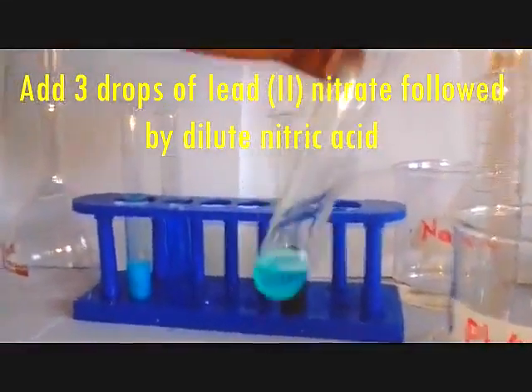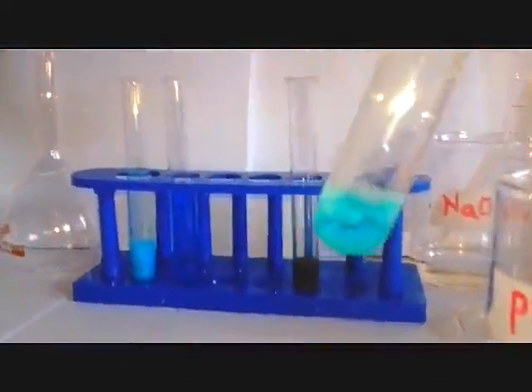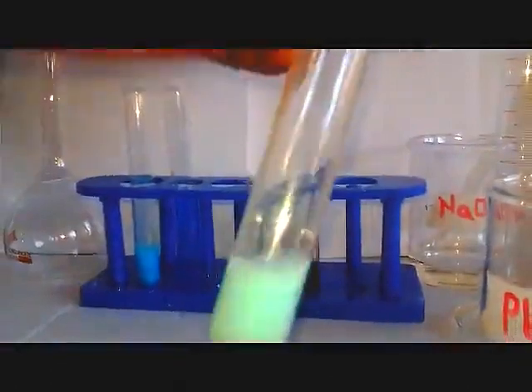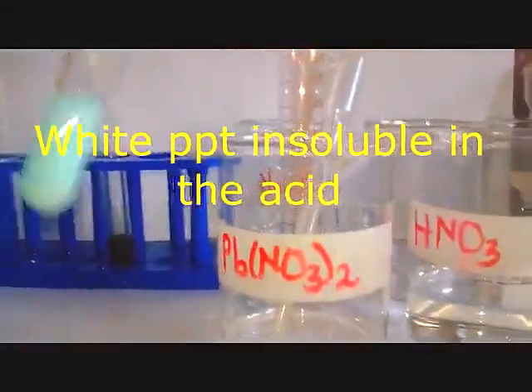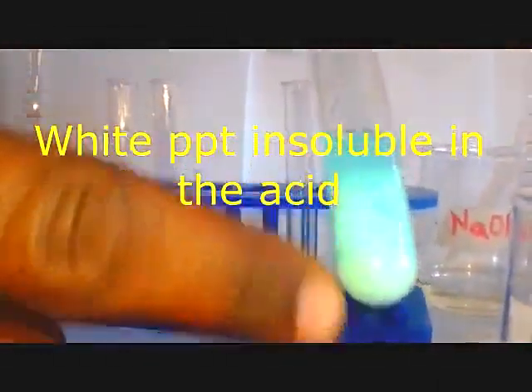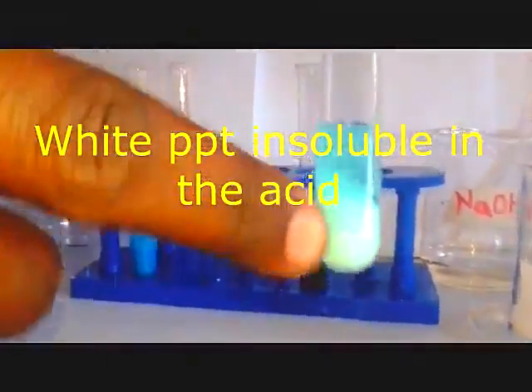first, we are seeing the color. This is a white precipitate, though it is in a pale green solution. So we add. Now we are getting a white PPT. And remember this procedure is followed by nitric acid, which is dilute. So in this case, we are going to record and say white PPT insoluble in nitric acid. You can see there, white PPT.